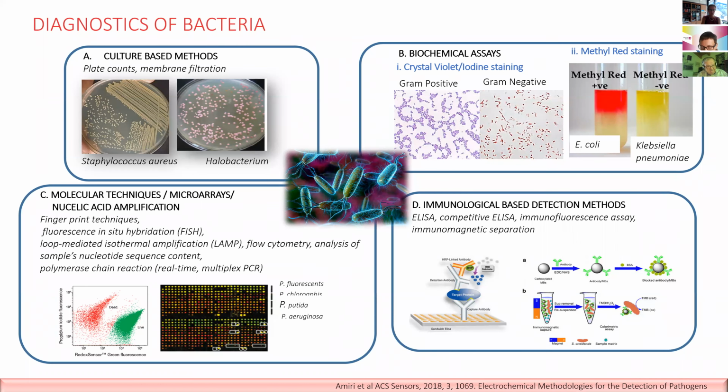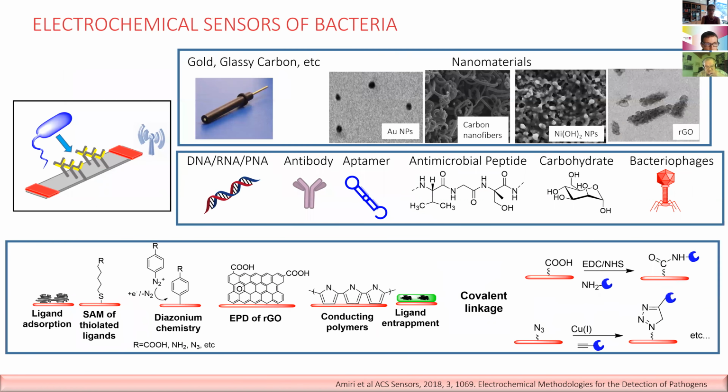But the issue with ELISA often is there's a limited detection limit, in particular when it comes to bacteria and viruses. And this is where biosensors could kick in because of their selectivity and specificity, but ELISA stays a laboratory-based instrument. So you could not imagine it as a point of care device, which eventually we want to develop with biosensors. So I work a lot on electrochemical biosensors.